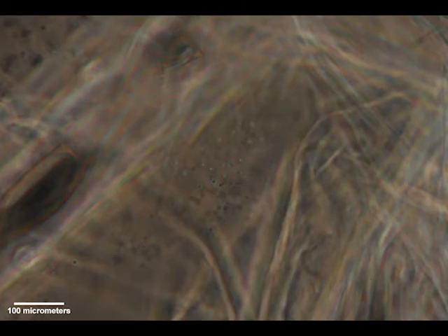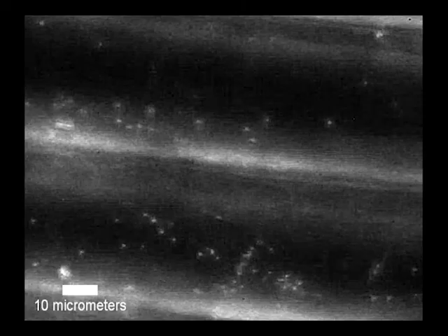The reason why I wanted to talk about cytoplasmic streaming is that we understand what it is, but we don't know how exactly it occurs or what its contributing factors are. So my main question that is the basis of this project is: what determines the speed of cytoplasmic streaming? Because throughout this semester in this imaging class, we've seen slow and fast cytoplasmic streaming.